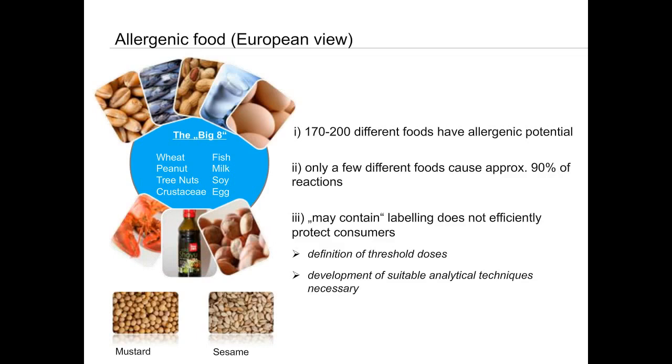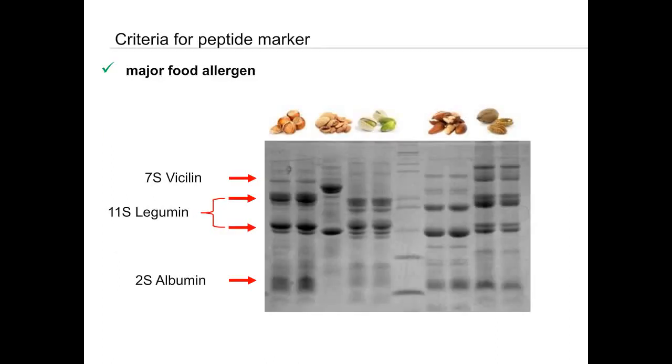One of the nice things is that we did not see really overfilling effects, which can occur if you fill up too many ions. This is something we did not see in our study. So we prolonged the fill time from the standard setup of 50 milliseconds to 250 milliseconds, which is the maximum fill time possible. The downside is that the cycle time also is increased.